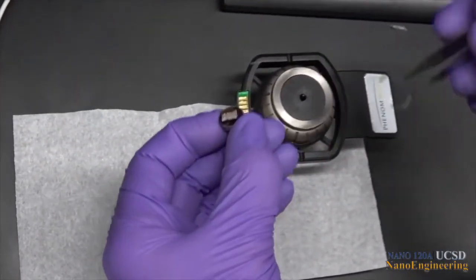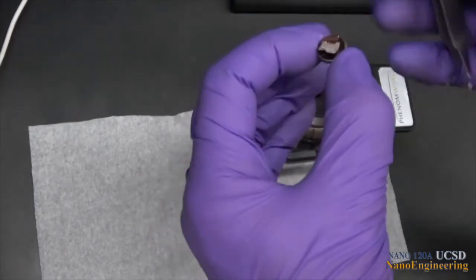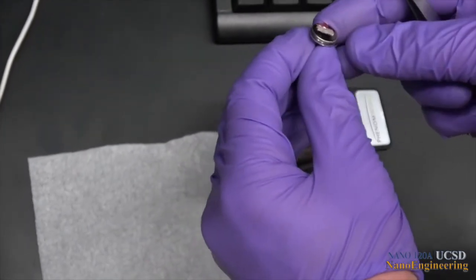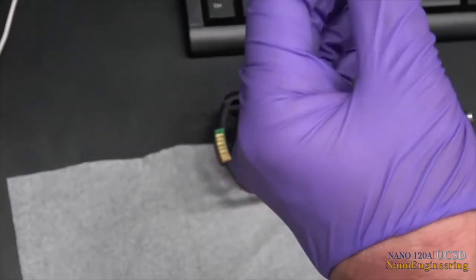Grasp the specimen mount around the sides with these special tweezers and insert the short stub into the hole in the sample holder.